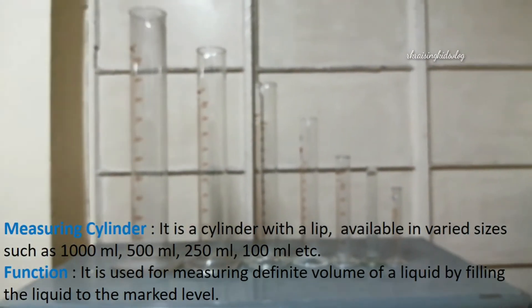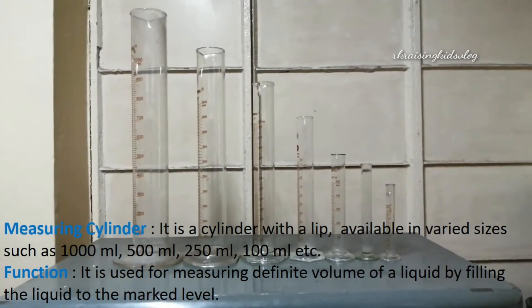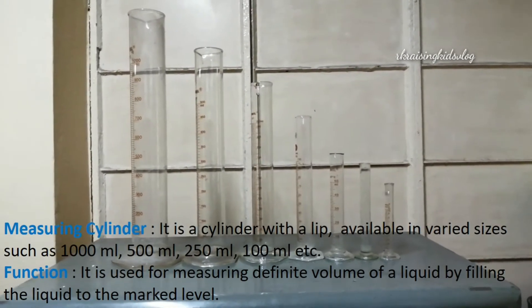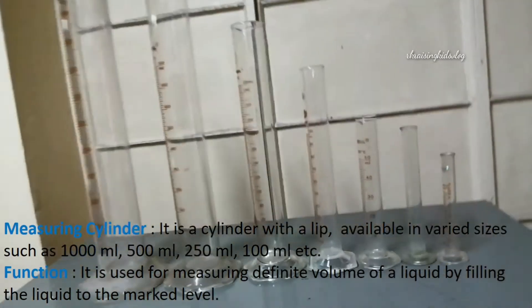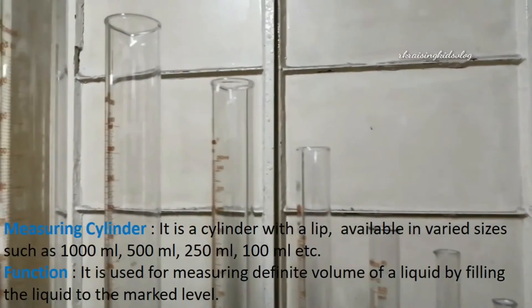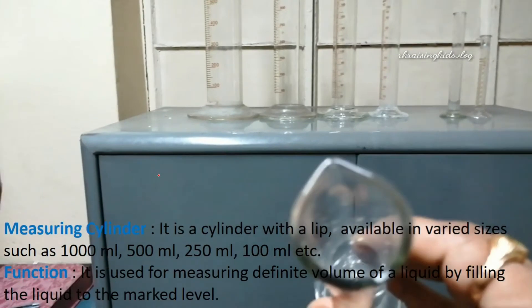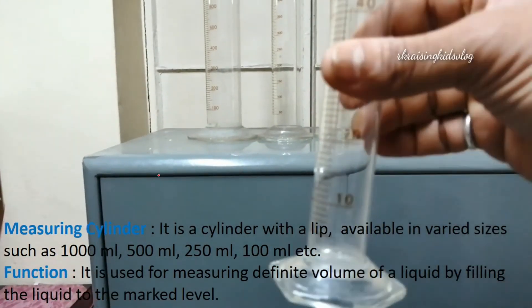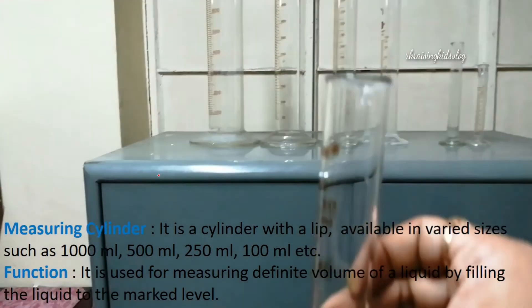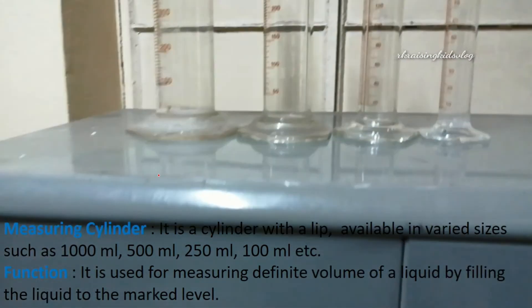The measuring cylinder is quite similar to the beaker. The only difference is that the beaker's mouth is wide open and it's easy to mix solutions, while the measuring cylinder is used for measuring a definite volume and its mouth is quite narrow. Both the beaker and measuring cylinder have a lip — here is the lip of a measuring cylinder.